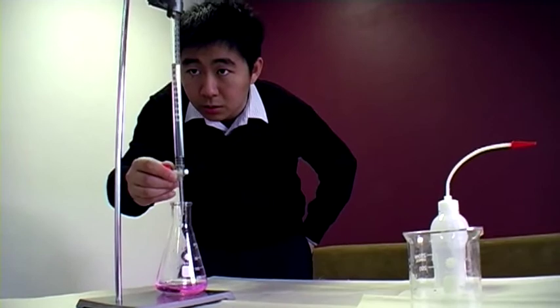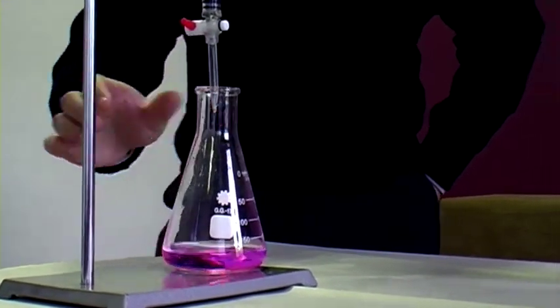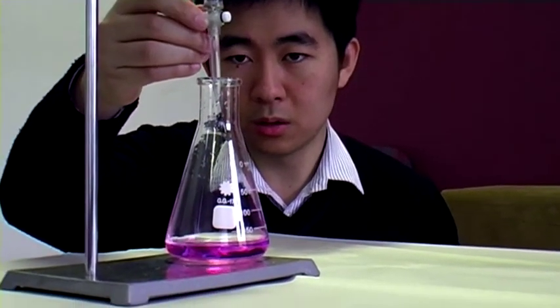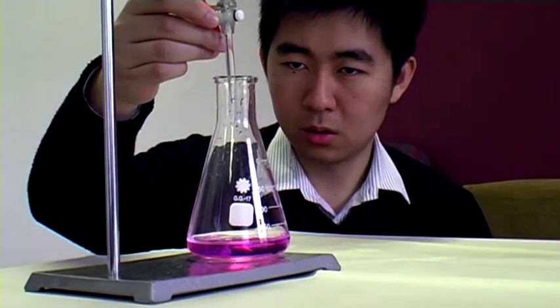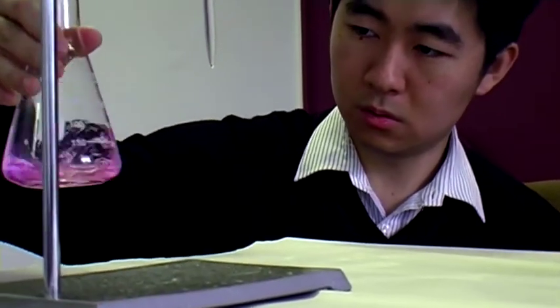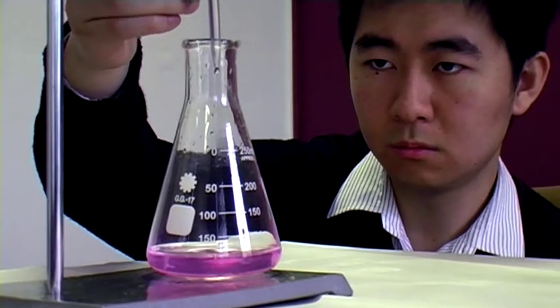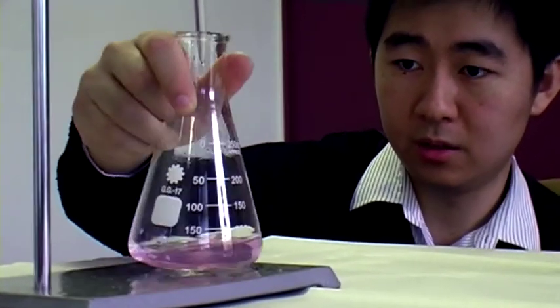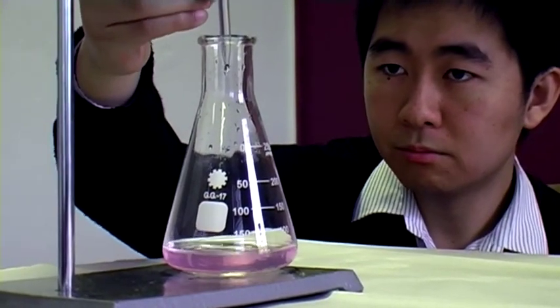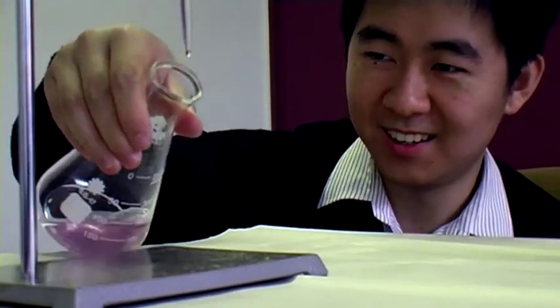We'll pay very close attention. Still pink, still basic — not at the equivalence point yet. Now, one drop at a time. Very light pink now; probably one or two more drops will do it. Still light pink — one more drop will do it, guaranteed. One more drop — and it's clear.